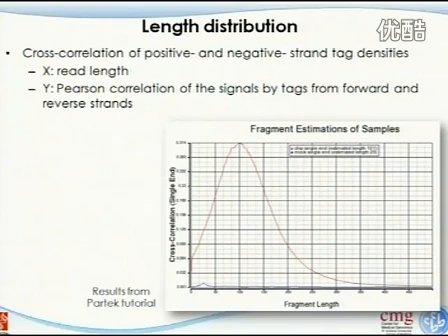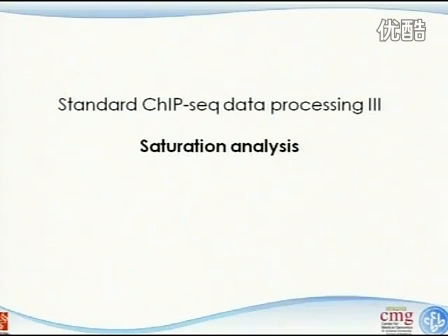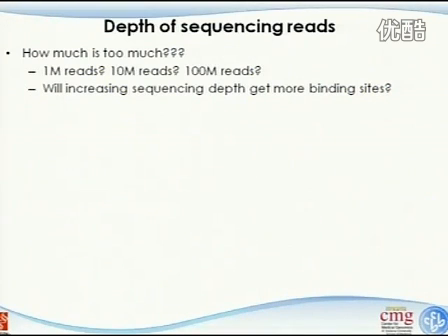Question? No? But this is a very important step we have to do, because when we do the peak calling, either tag shifting or tag extension, both use this information. Now, the saturation analysis. Most people are not familiar with this, but it becomes really critical.